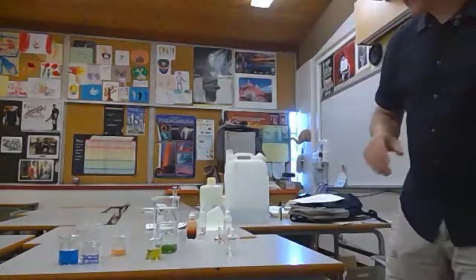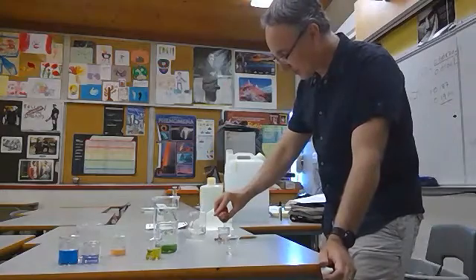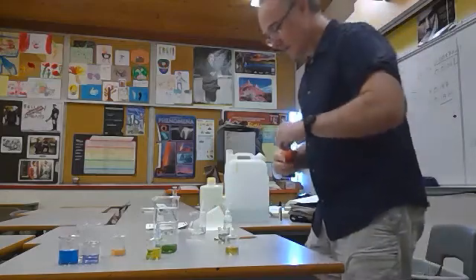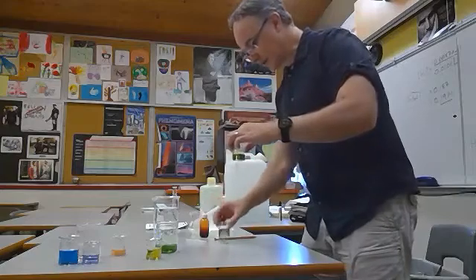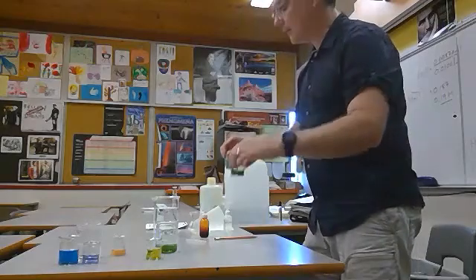And I'm going to use your universal indicator again. These should be close to the same pH. They're going to be off a little bit, but they should both be pretty close to 7, unless there's something in the beaker. Yeah, they're both a greeny color, slightly different, right?